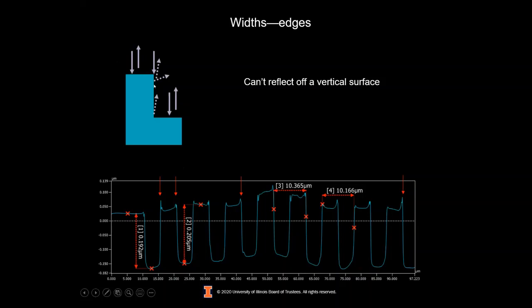But when you've got a vertical surface or a near vertical surface in the high 80s of degrees, almost 90 degrees, then when the light comes down, the few photons that scatter off something on the surface and make it back, it's a noisy measurement. It comes from different points along here, and you may not get a very good measurement. So the software may just guess.